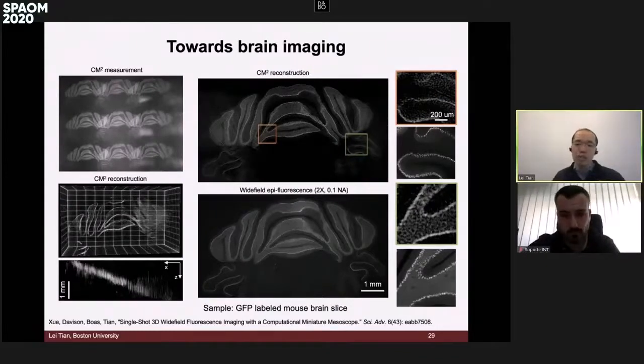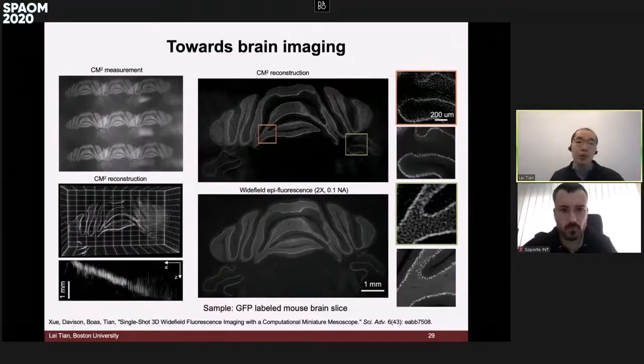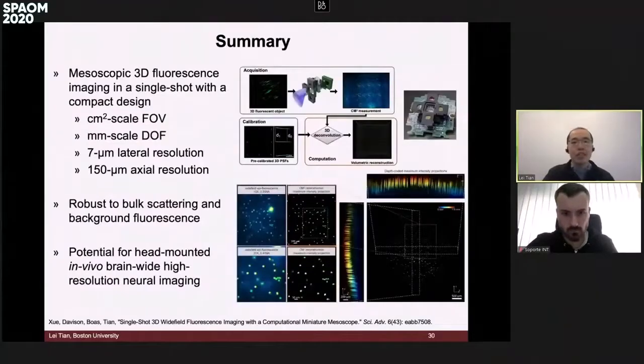So overall, the device suffered from low efficiencies. This hampered the overall imaging quality we can get from these biological slices. We're building the second version, and hopefully we will be able to report better results next time you see this paper. So with that, let me briefly summarize.